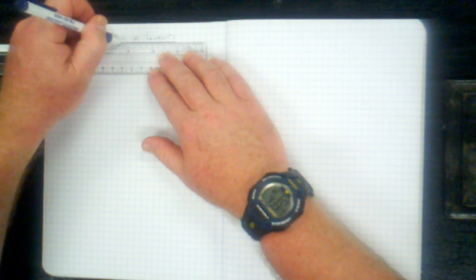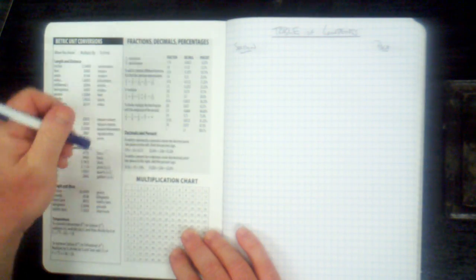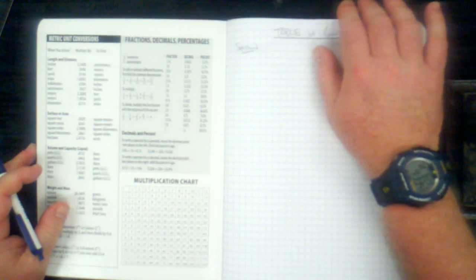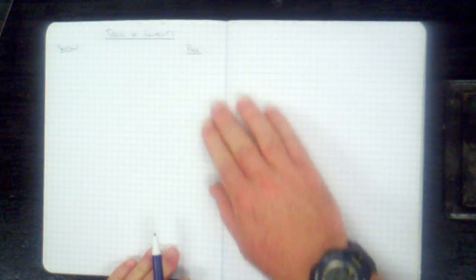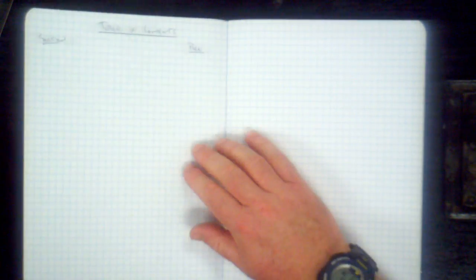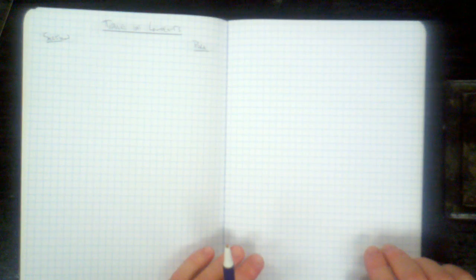Alright, so if you're going to underline more than one word, try using a ruler. It's handy to have a ruler that you can keep with your book. Sometimes you might want to make a little pocket here on the side that you can slip a ruler into, because you're going to use it a lot for drawing tables especially, and drawing graphs, and drawing straight lines, and so on and so forth. Now obviously you've got to number the pages to show that all the pages we started with are all the pages we ended up with.